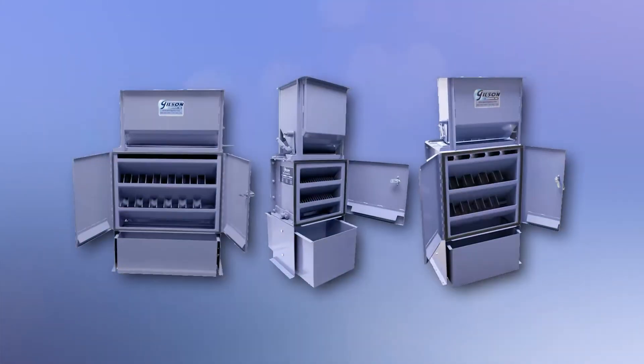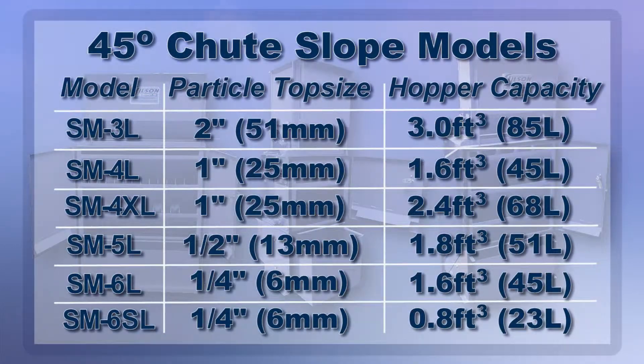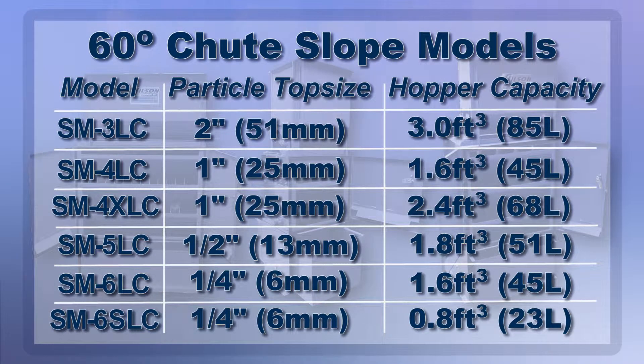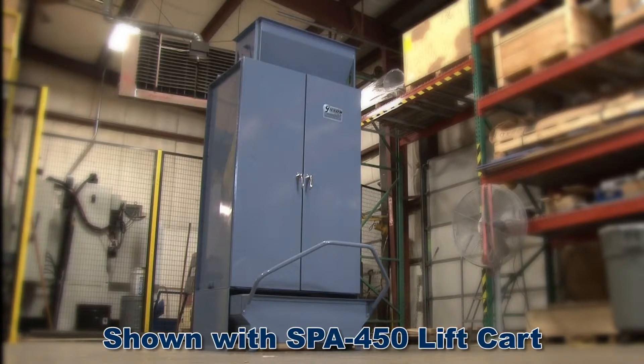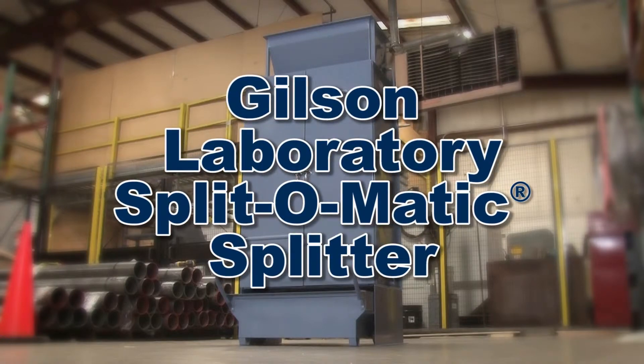Gilson offers multiple Split-O-Matic models that are well suited for aggregates or many other free-flowing granular material. Custom ordered laboratory splitters are available with four or more chute stages for sample fractions smaller than one-eighth, making the Gilson Split-O-Matic splitter the right choice for your material testing lab.